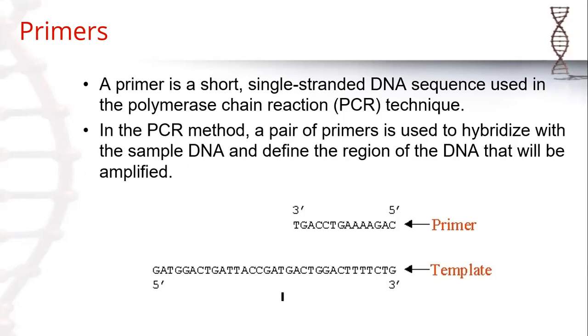Because if you are just seeing the whole DNA sequence, which may be 100 to 10 kb base pairs, and you don't know which region you want to amplify, and you design primers according to different regions, that is a total wastage of the reactions and your time and money. So you have to know which region you have to amplify through the PCR reaction, so that you will design the primer according to that region.